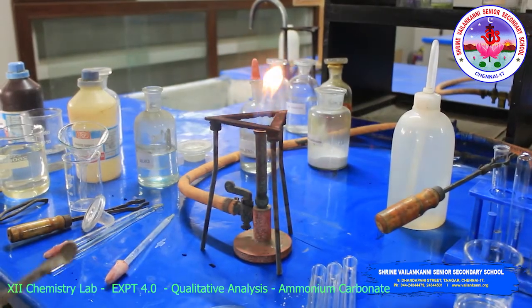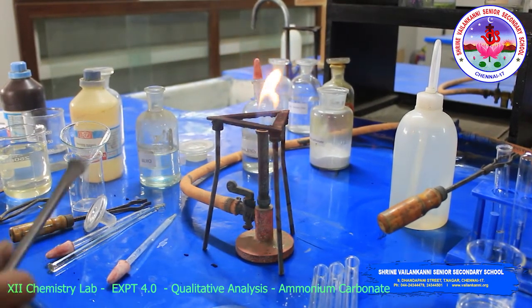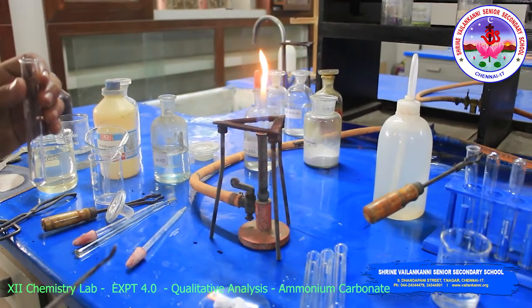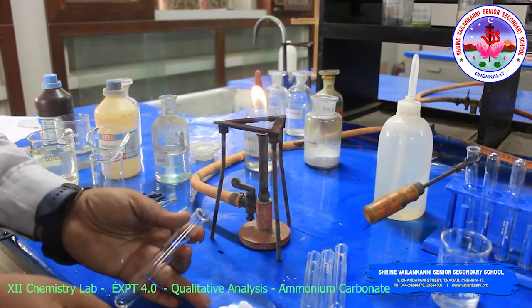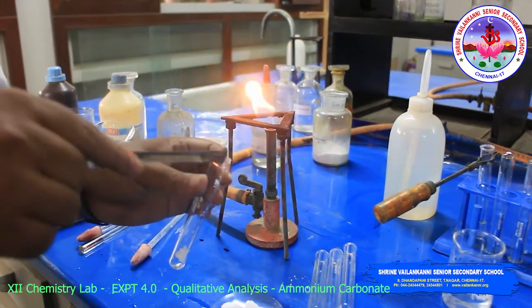See, the next salt is ammonium carbonate. Already we did ammonium chloride, this is ammonium carbonate. Now I am going to test the acid radical. Here the acid radical is carbonate.